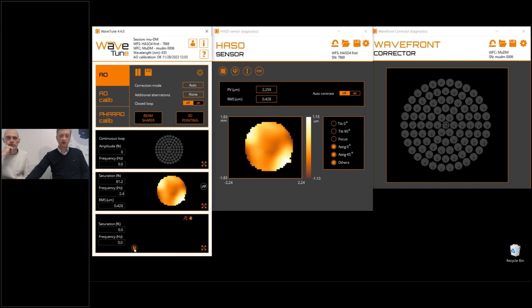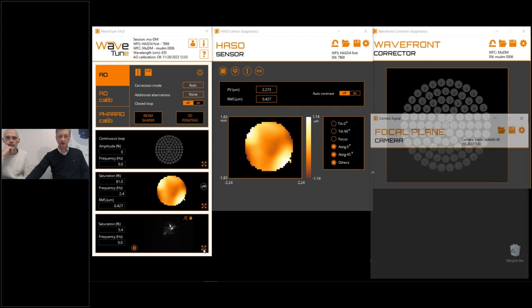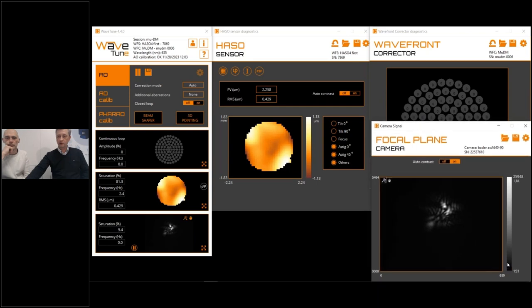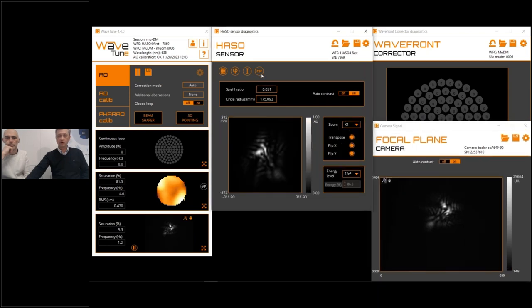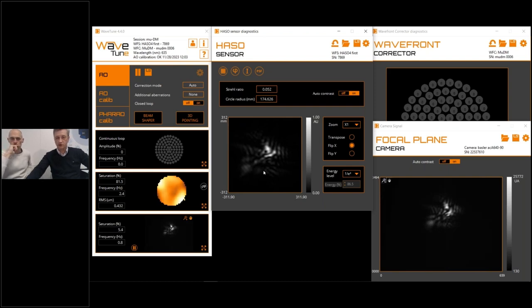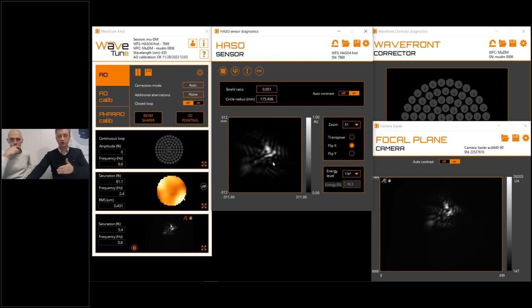Since we also have the diagnostic camera for the point spread function, you can see that we are measuring a quite distorted wavefront. We can compare the two and orient them to coincide. The measured point spread function and the calculated point spread function from the wavefront sensor coincide to even the smallest details, showing good conjugation of the two devices.